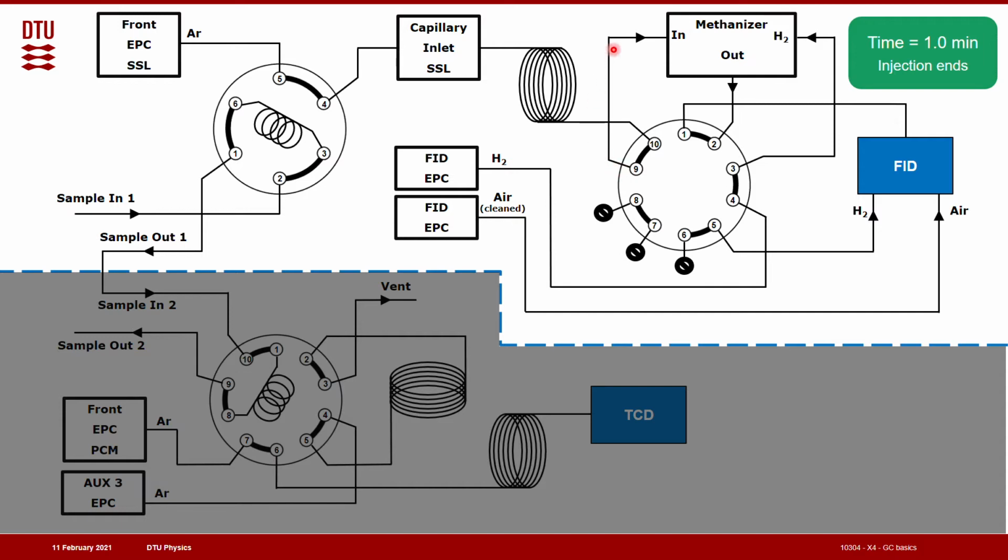So first we get the CO. CO leaves and is led into the FID where it's getting burned off and detected as a small current. Then, with not much time difference though, the methane is passed through the methanizer as well. And we could bypass the methanizer before the methane, but the two peaks are so overlapping that it would cause a disturbance in the detection.